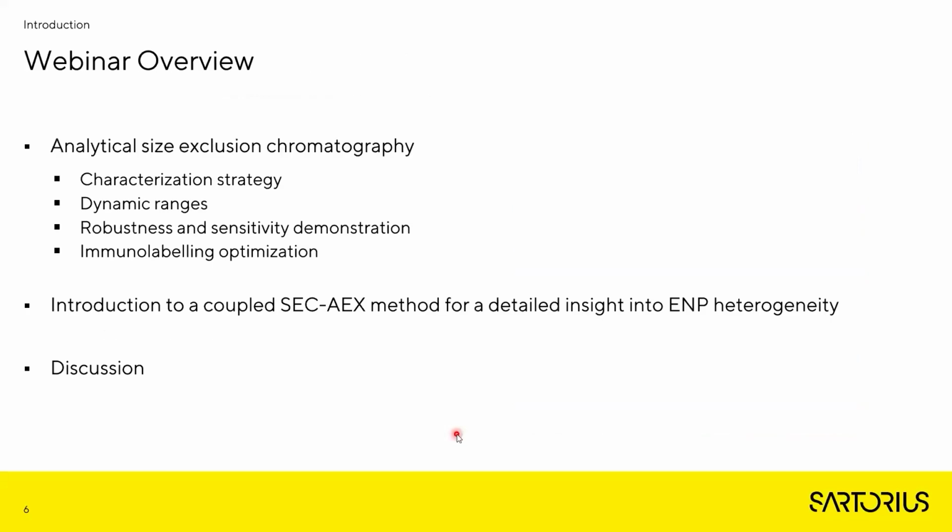So the aim of this webinar is to propose or to describe our approach using chromatography as one such tool that can address some of these questions. So in the first part, I will describe our method, what information we can gather from analytical size exclusion chromatography.